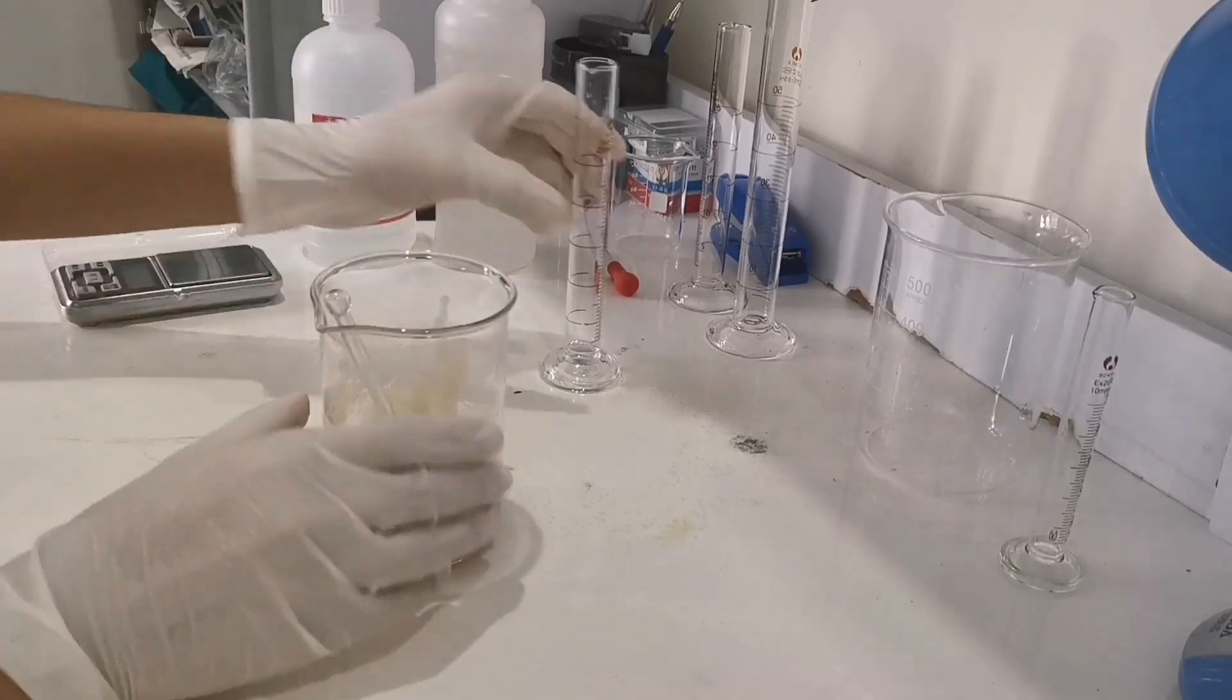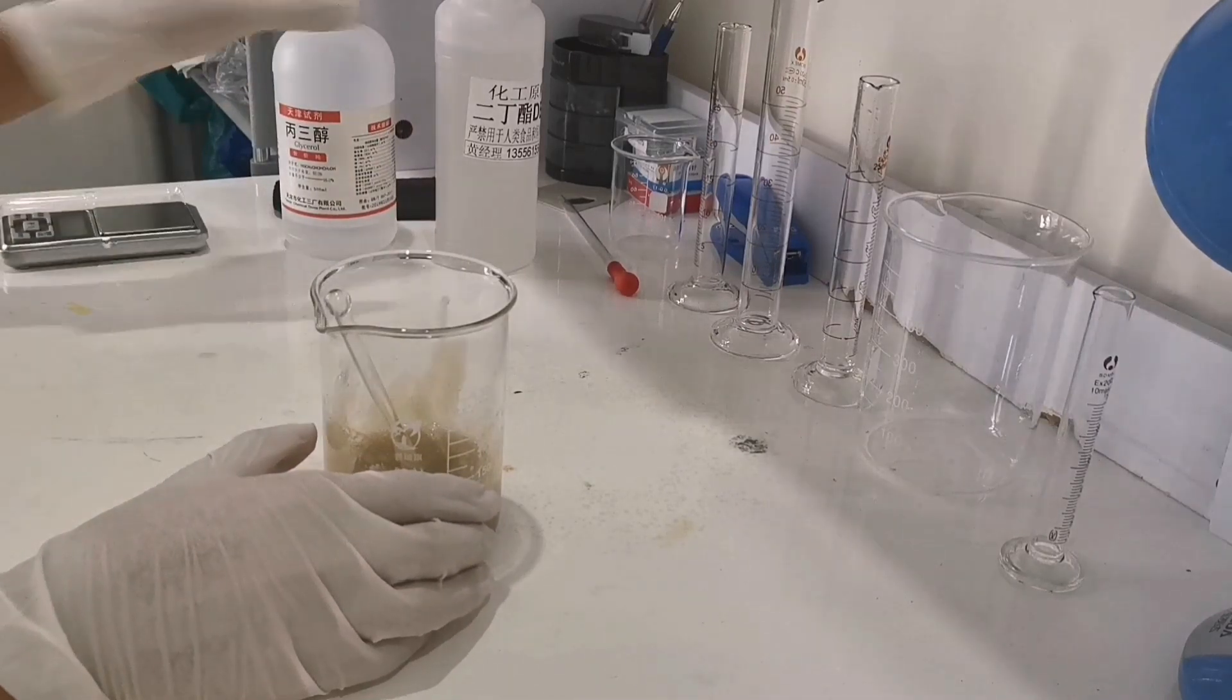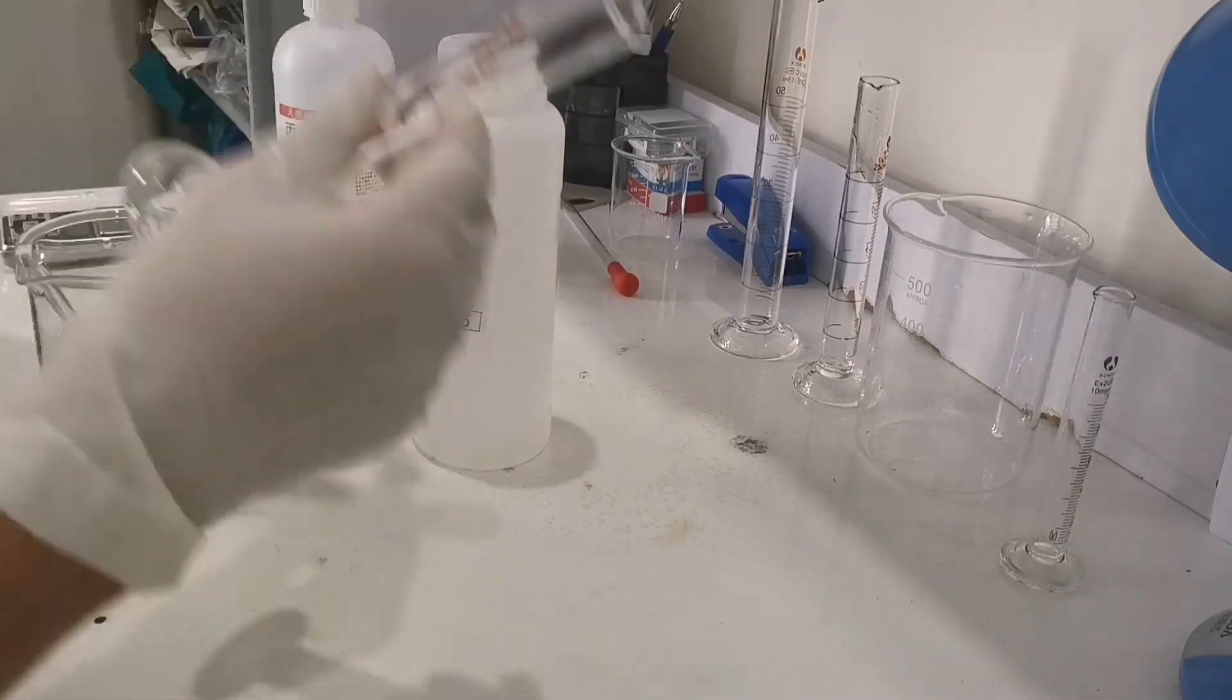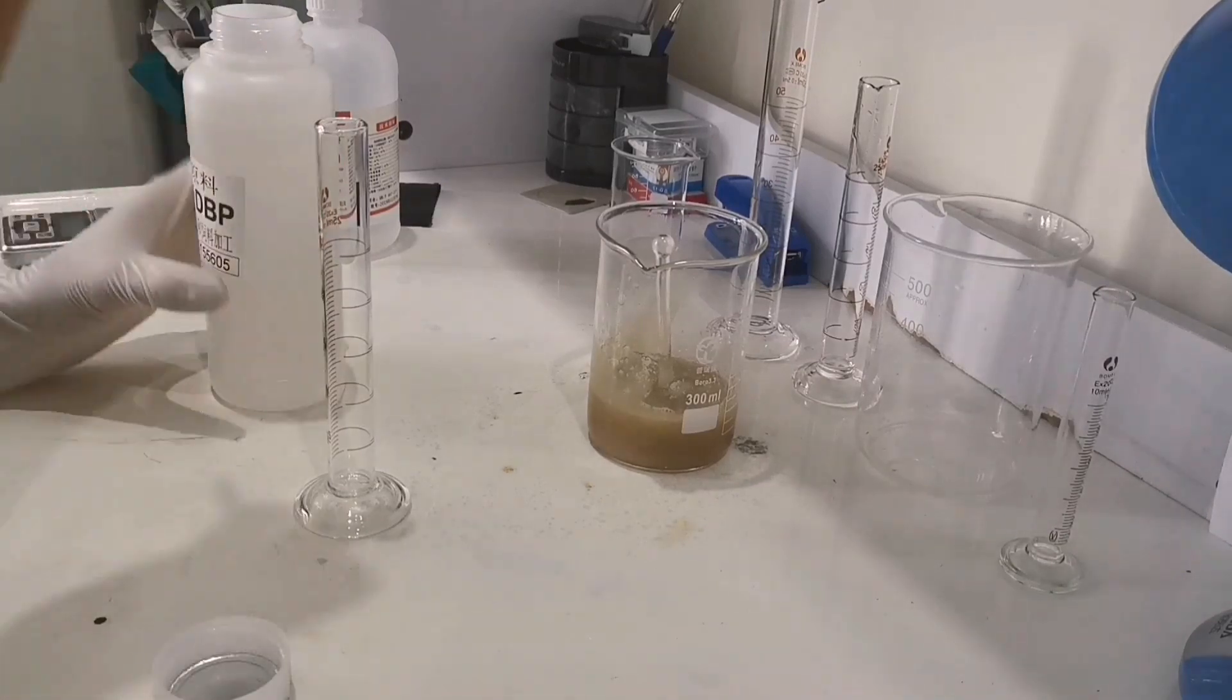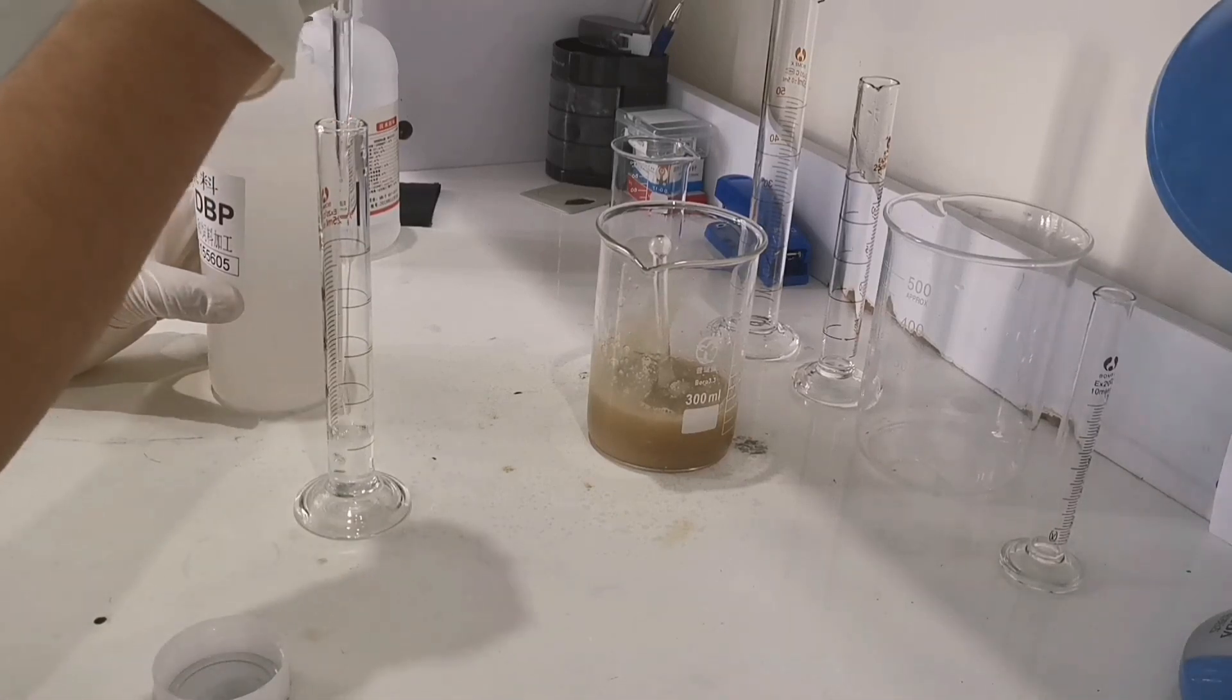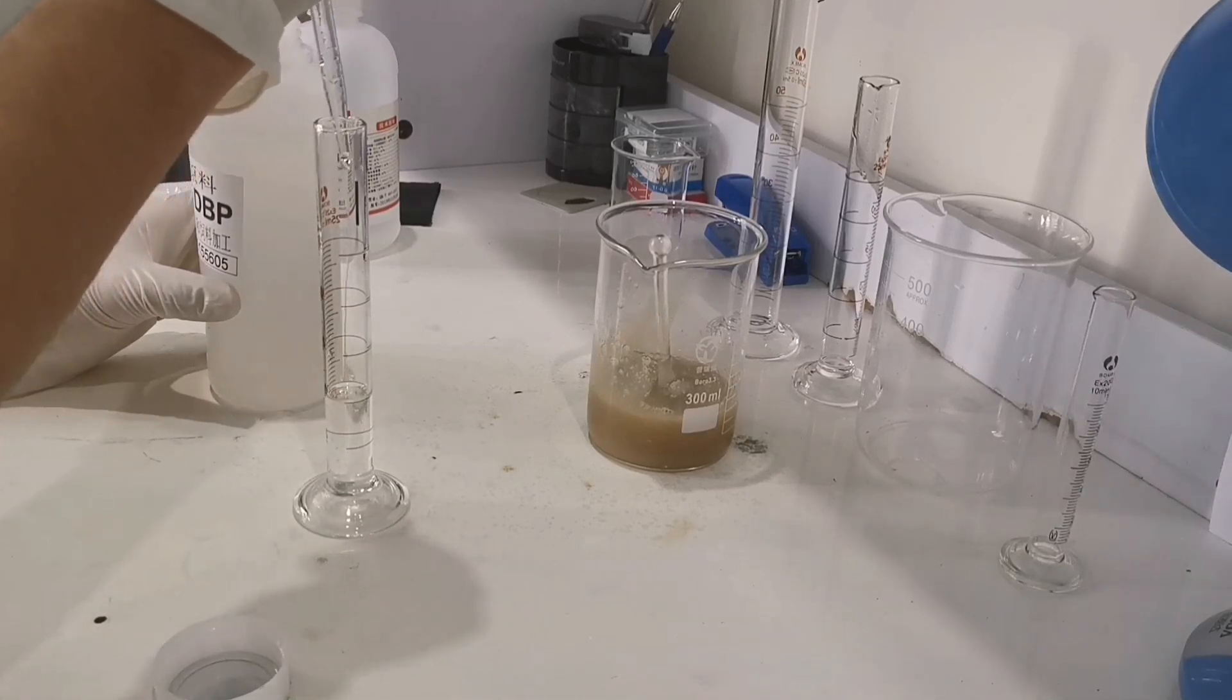When I saw the solution got hard again, I think it's time to add the DBP into the beaker. I took out another measuring cylinder and I measured out about 10 ml of DBP. If you were using 29 grams of glycerin instead of 10 ml of DBP, you can actually skip this step.